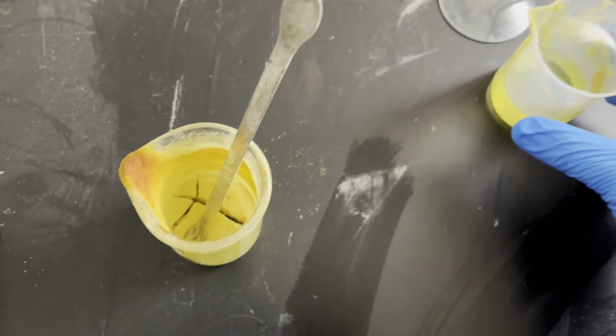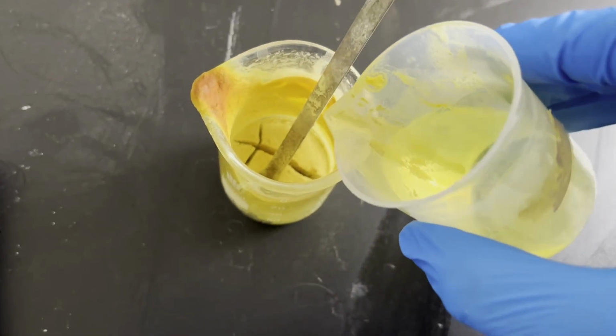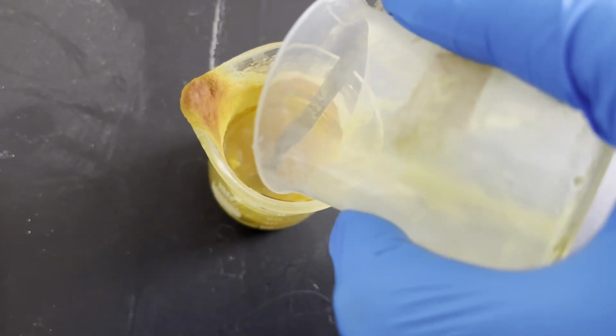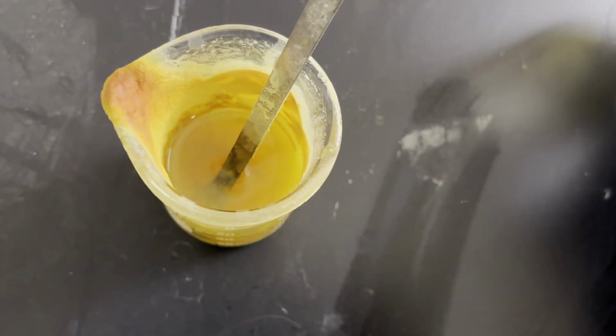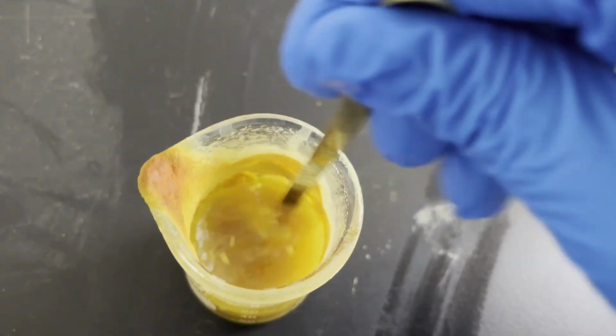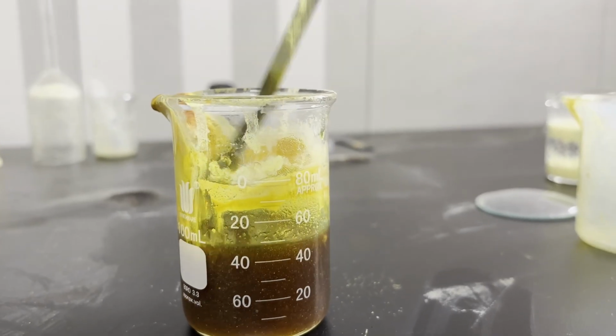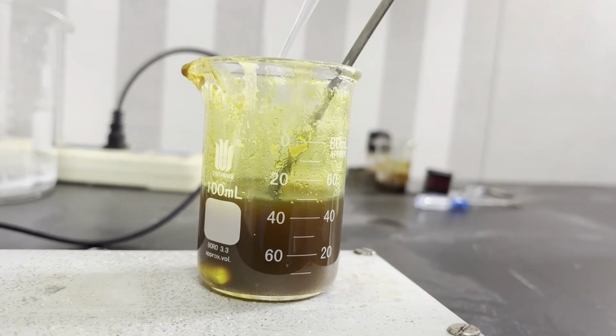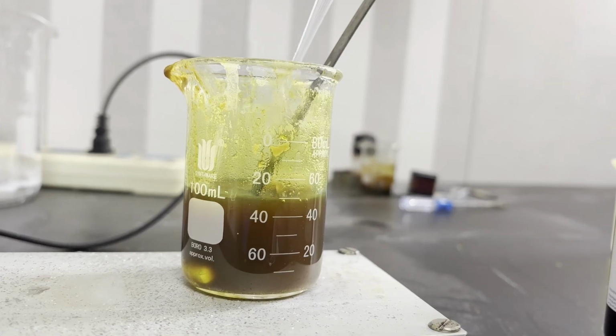With the new reaction conditions in hand, I proceeded to convert my remaining acridone salt. I first measured out 30 grams of DMF and added it to the acridone salt. The ethanol in it had evaporated and the surface of the salt turned to a beautiful orange color. The salt dissolved readily to afford a dark yellow-brown solution. I then added 10 ml of methyl tosylate, which is in excess to the acridone, into the solution, and no reaction seemed to take place.